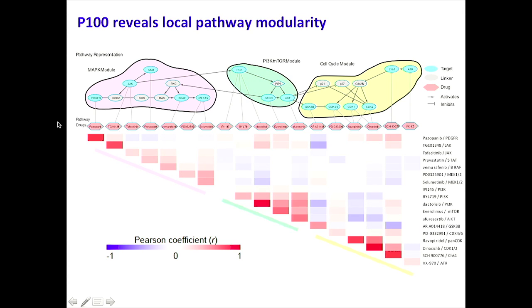And what we can see is, for most drugs, there's quite strong correlation along this diagonal, which means that replicate recall, or the ability of repeating the experiment to generate a similar signature in the assay, is quite good. And the strongest correlation is along the diagonal. This is what we hope for and expect, and it's reassuring to see it.